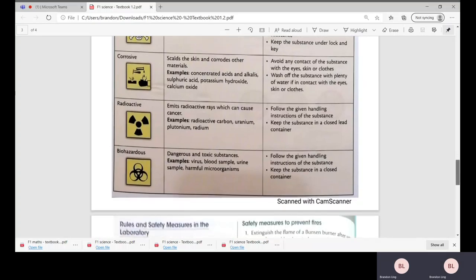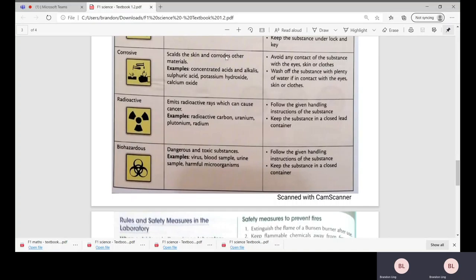Corrosive basically means that it can actually corrode other materials—it can corrode our benches, metals, wooden materials, and even scale the skin. Examples would be concentrated acids and alkalis. Whenever you get into contact with strong acids or alkalis, sulfuric acid in the lab, please remember to wash your hands immediately.